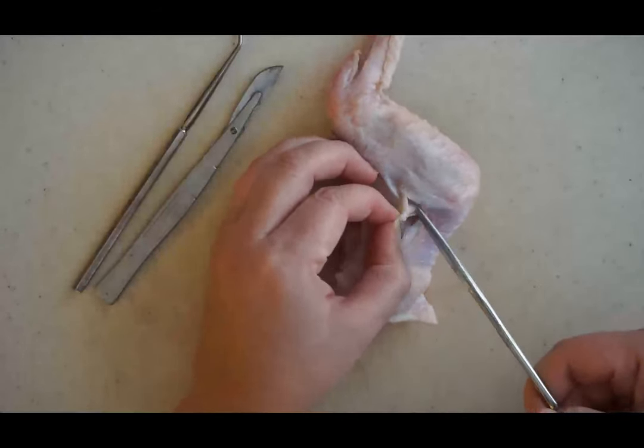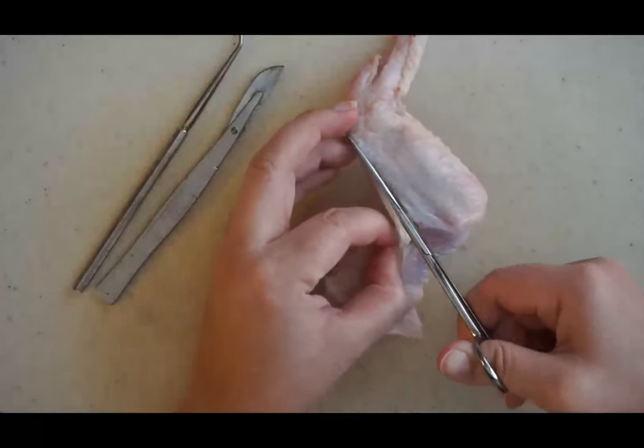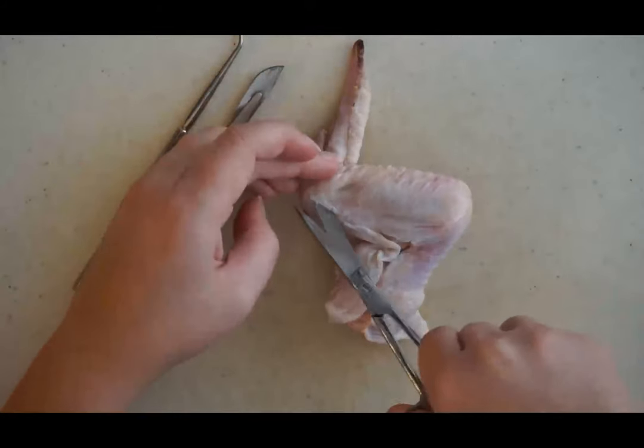Just this portion alone may take you about 10 minutes, and that's okay. It's better to take your time and be careful so that you don't cut through anything you're going to want to look at later.